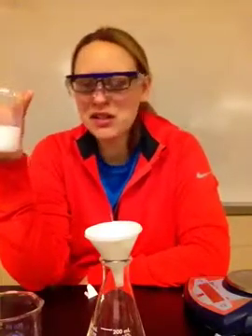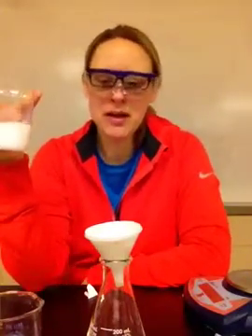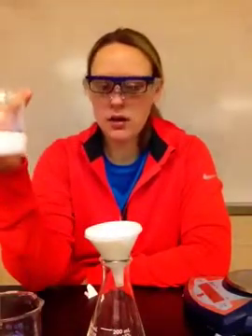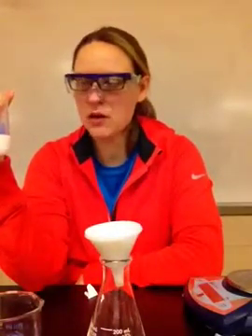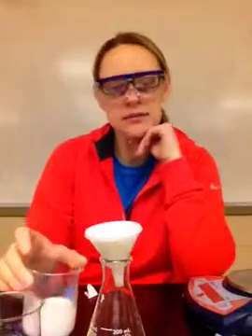Okay? If there's something in there like copper or whatever, it can make it heavier. All right, so you're going to want to filter this until the liquid and the solid have separated. Okay, we'll talk about a few other things, but that's your whole goal: you want 2 grams of this white solid.